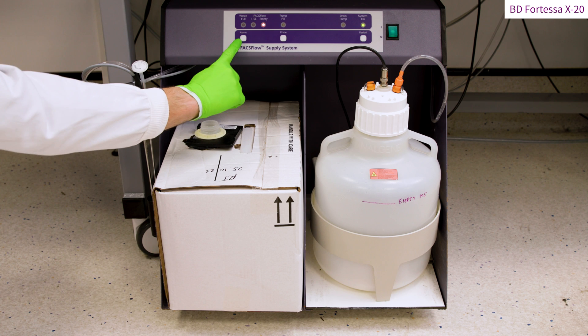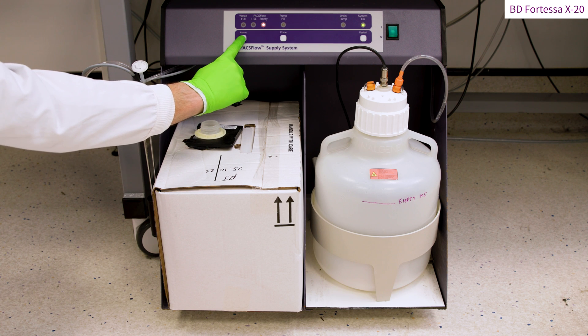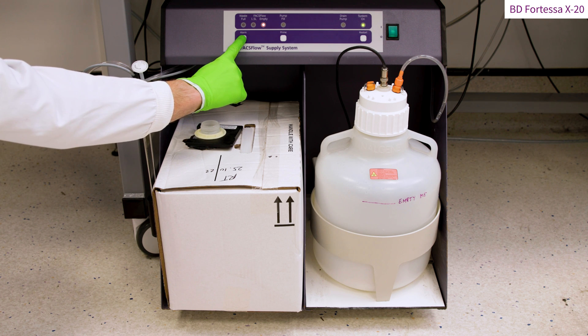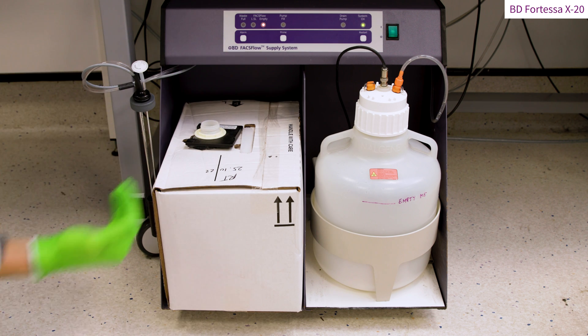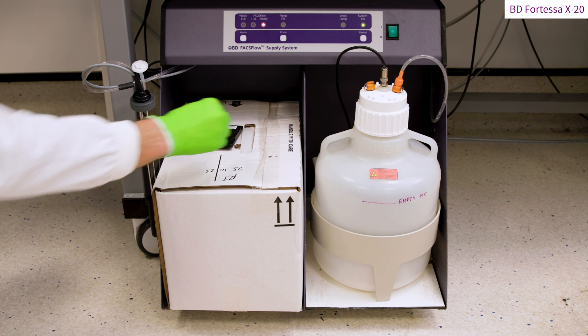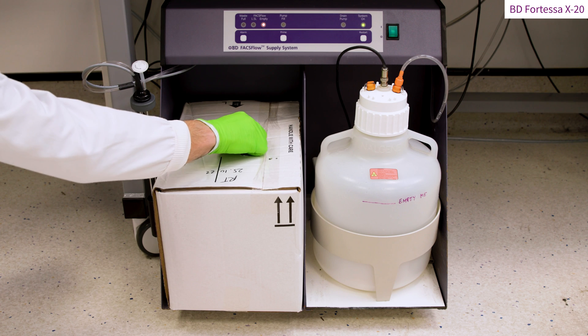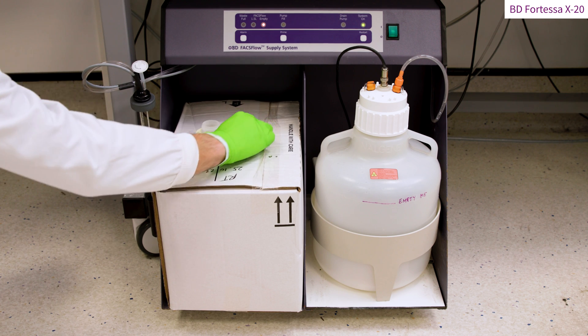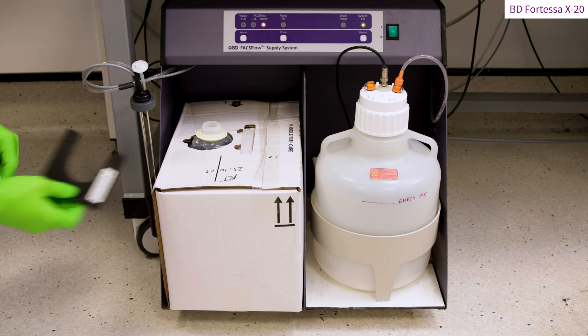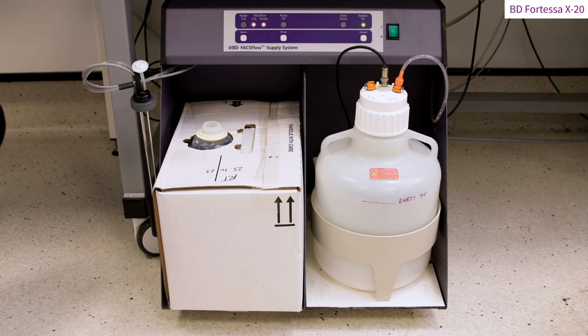Disable the alarm by pressing the alarm button found on the fluidic cart. Remove the FACSFlow container neck holder. Remove the empty sheath fluid tank.